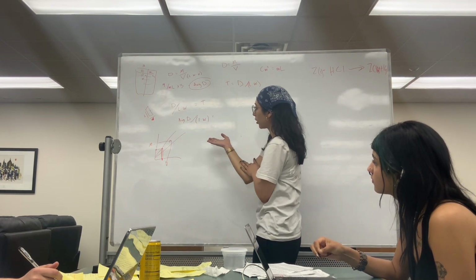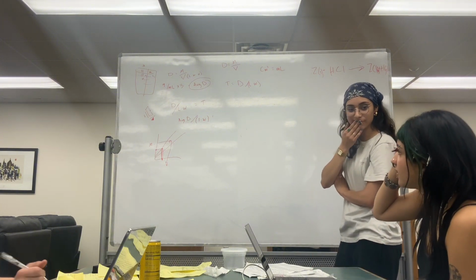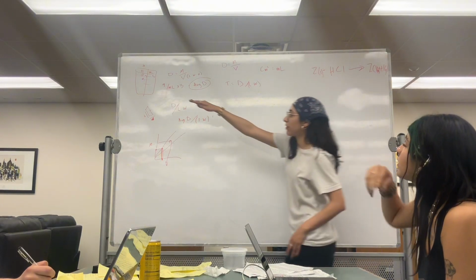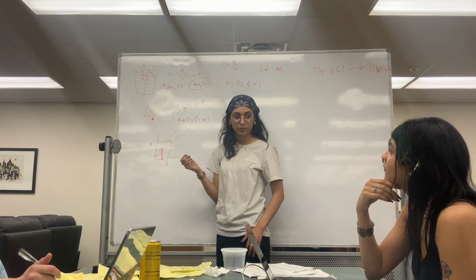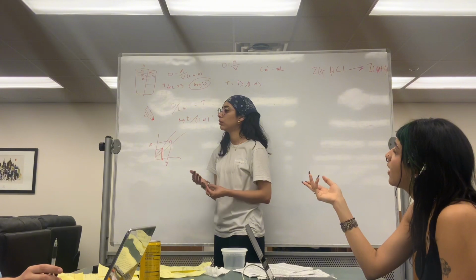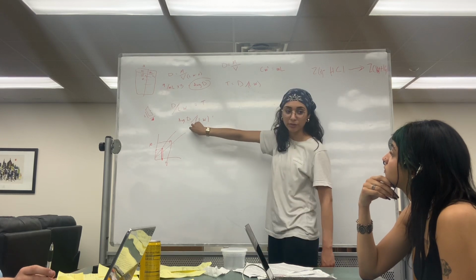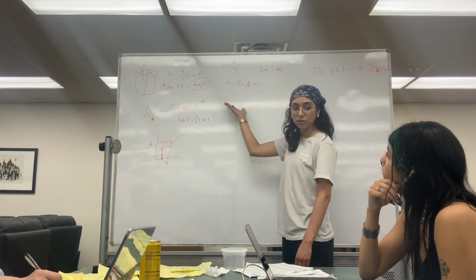What is this? Oh, to find the density, it gives you like 5 sets of mass and volume. We're gonna do it about 5 times and then average. I don't know if it's exactly 5, but I'd just do 3 of them, which is a good sample. Do 3, then you average those, and that's what you use for your density. So we'd average first, and then we would go into this.